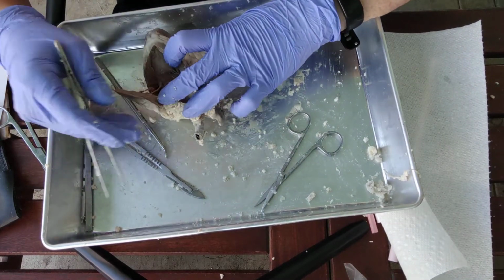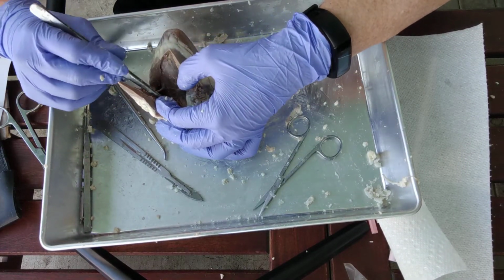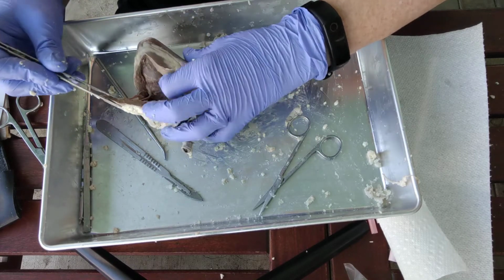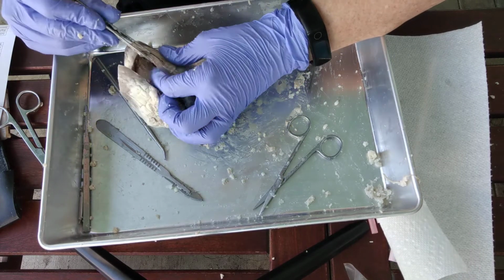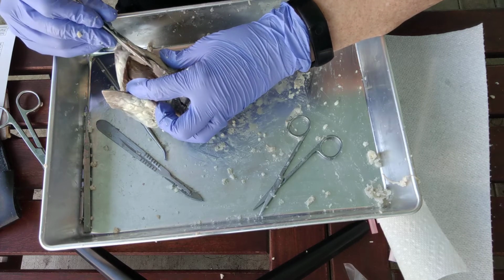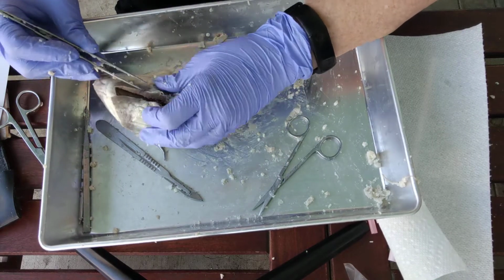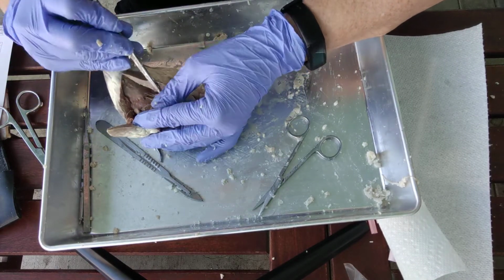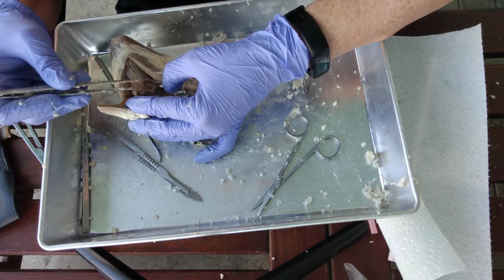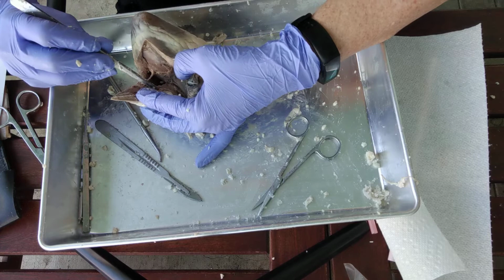Other things to look at: I know that this is the tricuspid valve, even if I can't see all 3 cusps, because I know that I'm in the right ventricle. The reason I know I'm in the right ventricle is because the wall of the ventricle is relatively thin. So try it on the right, try it on the left. The tricuspid valve would be in the right ventricle. The other thing is, I see the cusp, so I know it's a valve, but I know it's one of the AV valves, one of the atrioventricular valves, because of the presence of these little strings here.